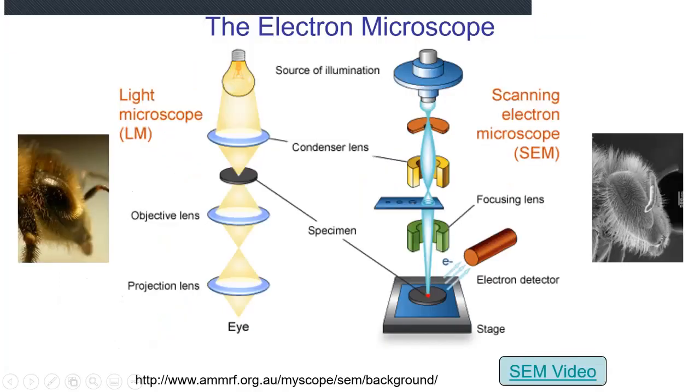And in some ways, kind of similar. Here on the left, you've got your light microscope. And on the right, you have, sorry, I'm just looking for my pen. I don't know what I did with the pen. On the right, you have the electron microscope.